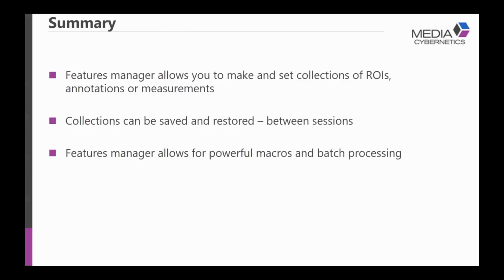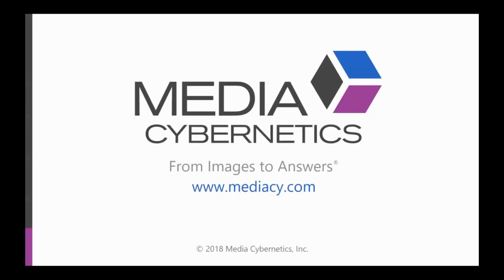So to summarize feature collections, the Features Manager allows you to make and set collections of ROIs, annotations, and measurements. Collections can be saved and restored, and you can do this between sessions. And the Features Manager allows for powerful macros and batch processing. And that brings me to the end of my presentation on feature collections.